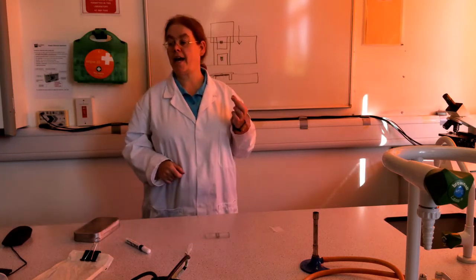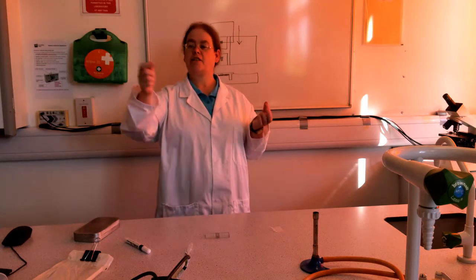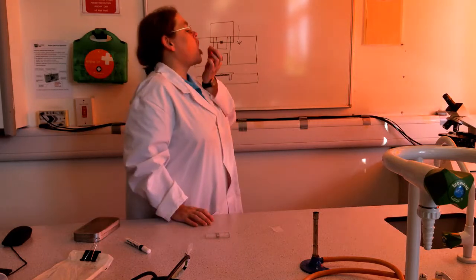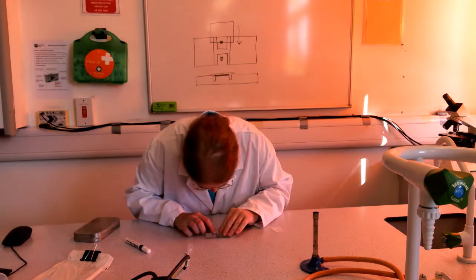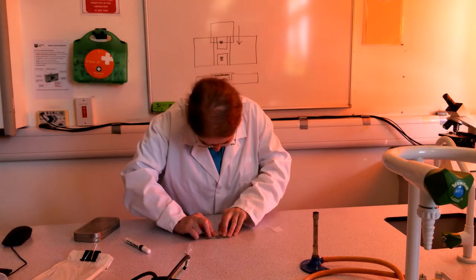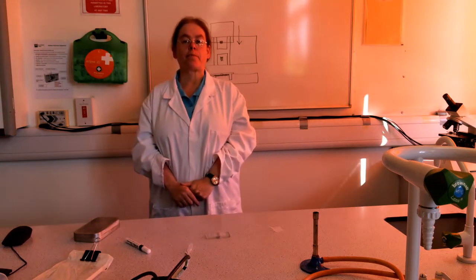So, okay, again, I know it's difficult to see a demo from there, but if you were in the classroom, you'd be sitting at the desk going, what is she doing? Anyway, so it's like this. And then I press right down, slide my cover slip into place.